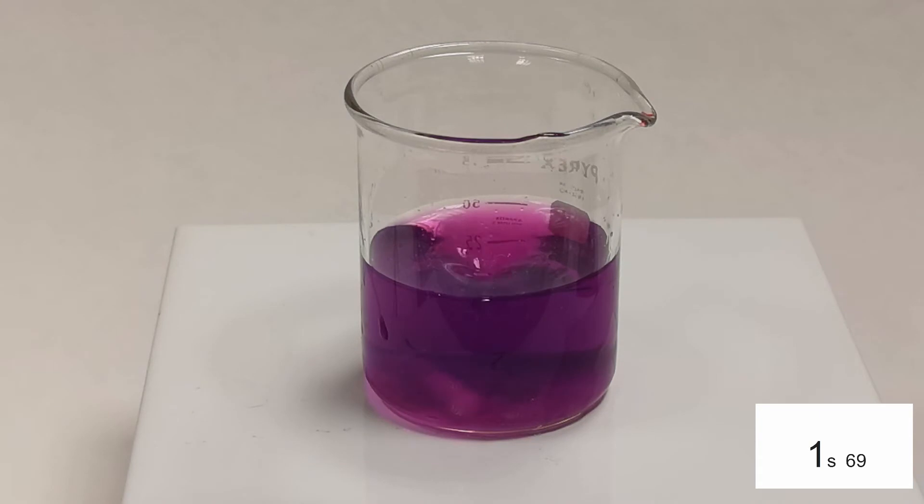Another factor affecting rates of reaction is temperature. This reaction is of potassium permanganate with ethane dioic acid, oxalic acid. The reaction can be followed simply by seeing how long it takes for the purple manganate ion colour to disappear.